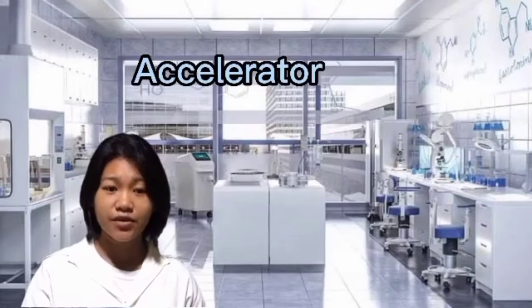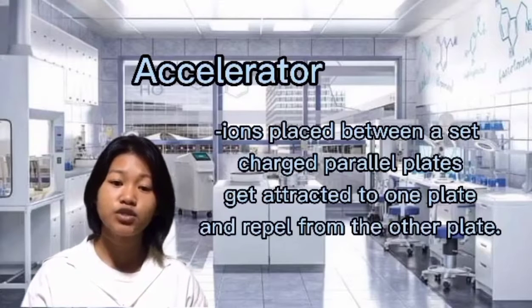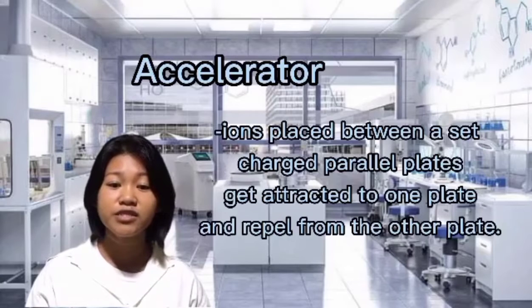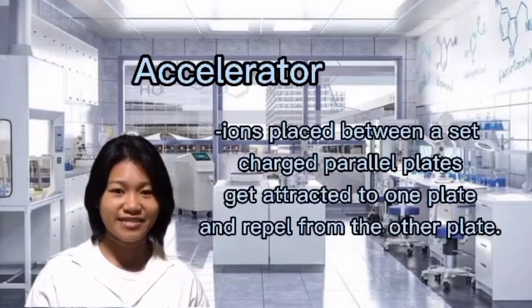Second is the accelerator. The ions placed between a set of charged parallel plates get attracted to one plate and repelled from the other plate. The acceleration speed can be controlled by adjusting the charge on the plates.